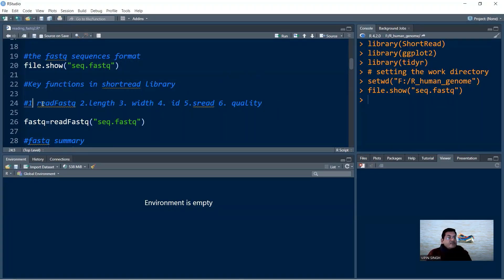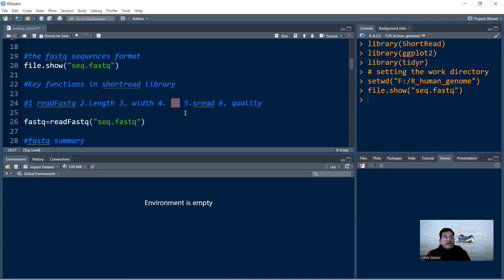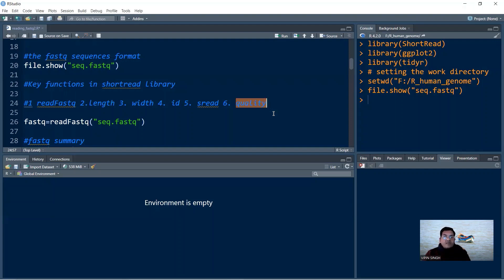There are six key functions in the ShortRead library. First, readFastq() reads the FASTQ file into an R object — note that for very large files, batch-reading functions are also available. The length() function tells you how many sequences are in the file. The width() function gives the length of individual sequences. The id() function pulls out the unique identifier from the first line. The sread() function reads the sequence line (the second line), and the quality() function deciphers the quality scores from the fourth line.